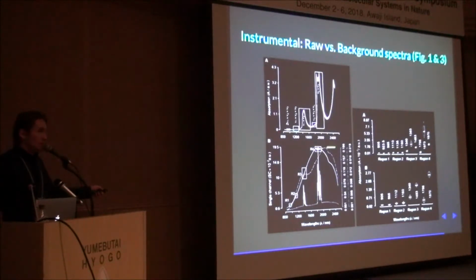So you just get these bands baseline and inverted, so they look like absorption bands. Basically, this whole region here is a mirror image. So you see 2 strongly absorbing regions, and also the regions that are not visible but are here. I have a next slide to show you.